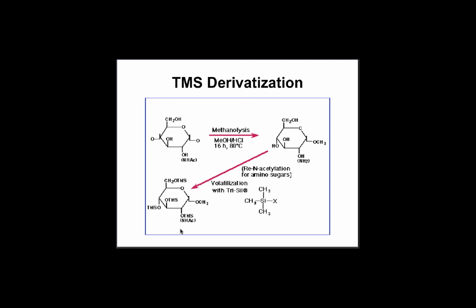How cognizant do you have to be that you're getting 100% derivatization? Like, is it always 100%? No. Yeah, you can have controls. These are very efficient reactions, so they go to very near completion, but you'll get combinations, so you might get 1, 2, or 3 silanization groups attached, and so you'll see 3 different or 2 peaks for a particular thing. If it hasn't been derivatized, it won't be volatilized, so you'll never see it.